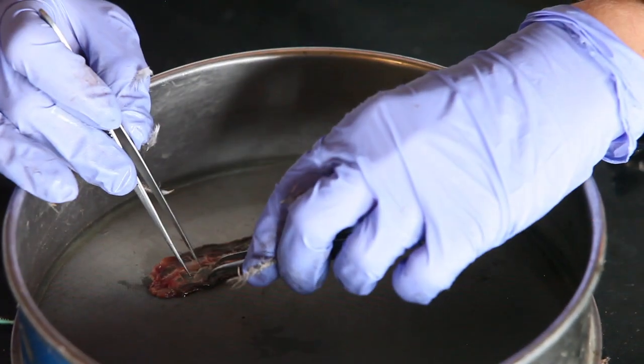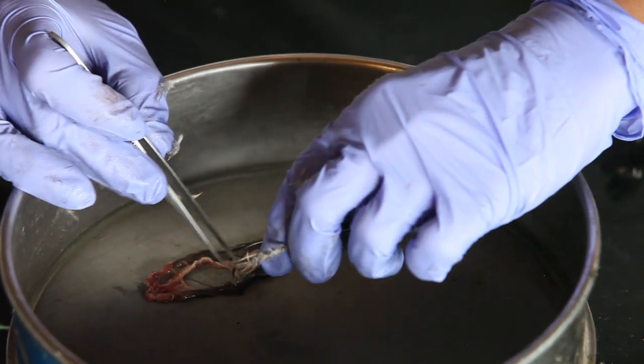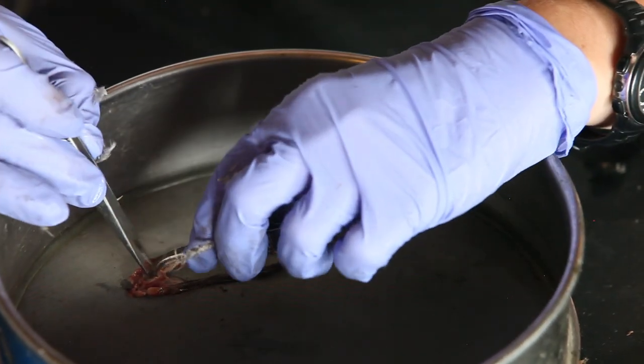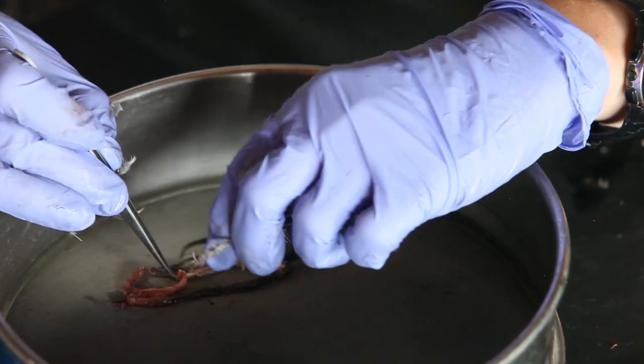Okay. So there's all this real thin connective tissue, so I usually will just go through and pull that apart. We're not interested in the small intestine. There's not going to be any cecal worms in there. So I like to just get that out of the way. So if we can separate it.